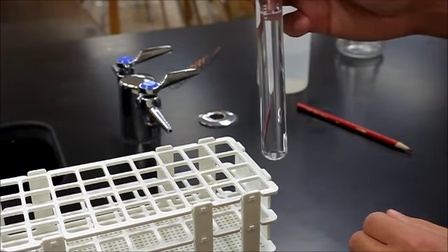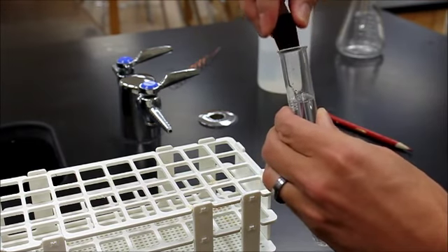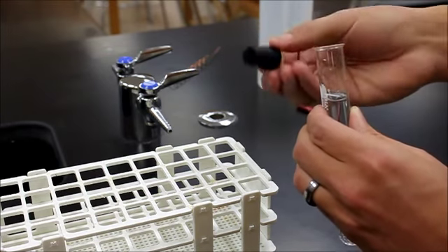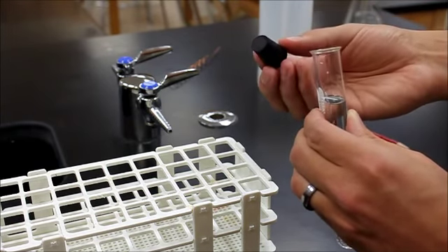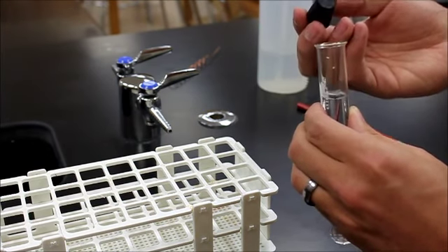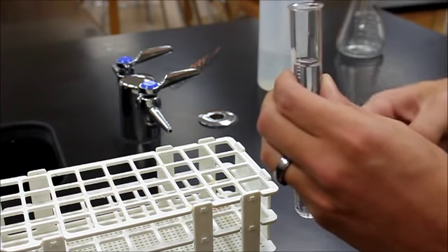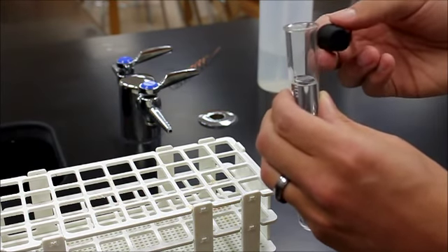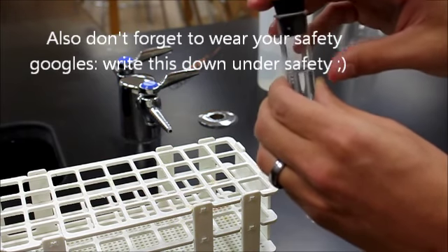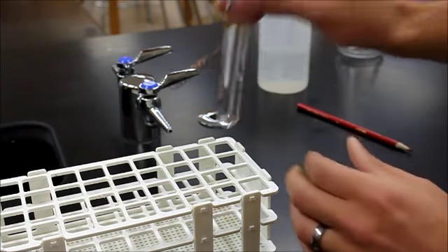The number one place where my students get it all over themselves is going to be when they remove the stopper. There's going to be a little bit of moisture on the inside of the stopper there. So you want to be careful that you're not putting your fingers all over the stopper and then getting silver nitrate all over yourself. For the rest of the reaction, try to stay away from this liquid as far as touching it with your fingers. The only time that your fingers should be coming anywhere near that is when you're actually pulling your filter paper out of the flask.